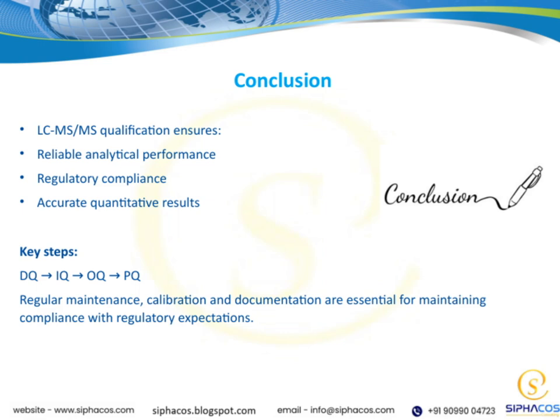Regular maintenance, calibration, and thorough documentation are also vital. They help you maintain regulatory compliance over time and ensure your system continues to perform at its best. Overall, this structured approach and ongoing effort are what enable labs to deliver precise, reliable, and compliant results consistently.